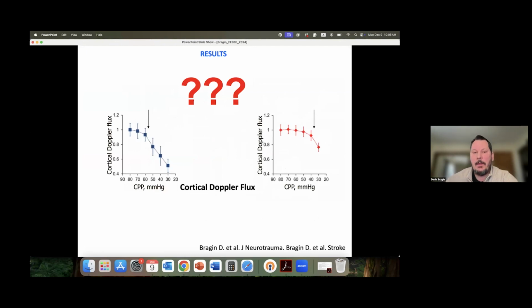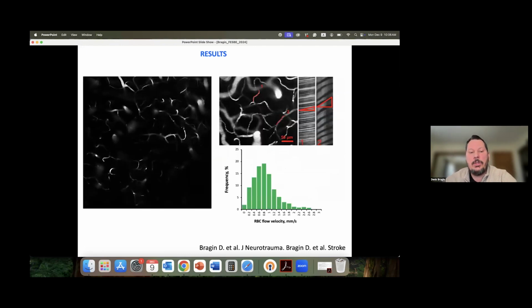So what was the reason for this phenomenon? And we were able to show this with imaging of blood flow velocity in each capillary and blood volume. So we used blood flow plasma labeling by tetramethylrhodamine dextran, and we used so-called line scan measurement, where we can measure blood flow velocity in each capillary by line scan. And here you can see the frequency histogram of frequency of occurrence versus flow velocity in capillaries in small vessels, which has a normal distribution.